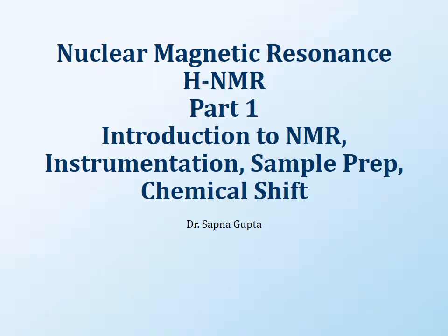Nuclear magnetic resonance. We are going to be talking about two different NMR techniques. One is going to be proton, the other one is carbon. So in this one, I'm going to introduce you to the proton NMR. There will be two presentations on the proton NMR, this one and another one. Not everything is completed in this one.